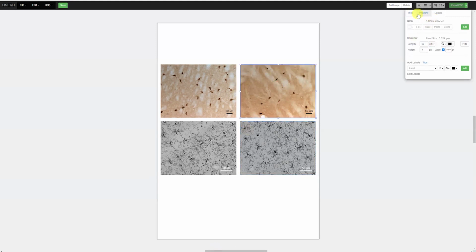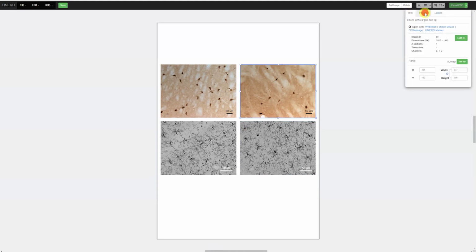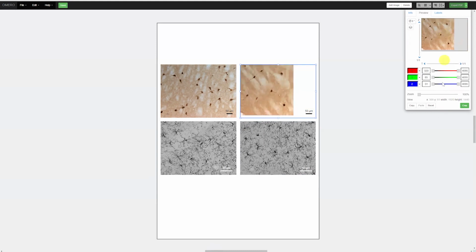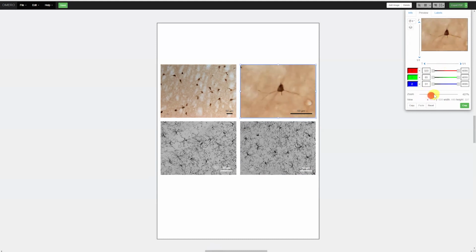Now, I'm kind of interested in this image, and I want to look at it a little differently. I want to put this one piece nicely in the center, and I'm going to zoom in on it so that it's very much in the center. Get this single neuron. You see what happened here with the scale bar? That rescaled itself in real time.